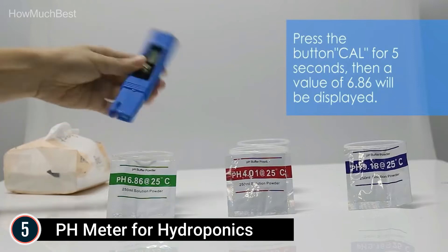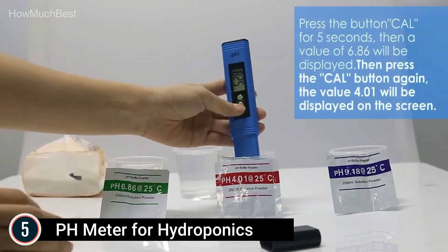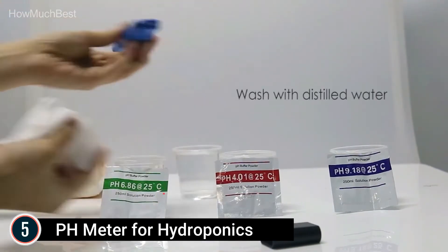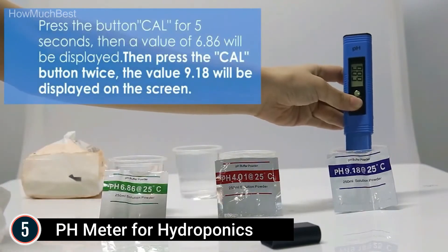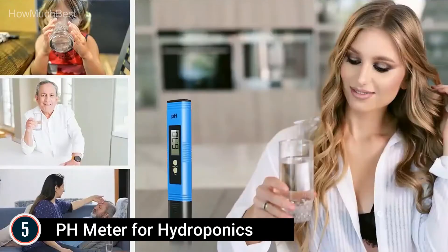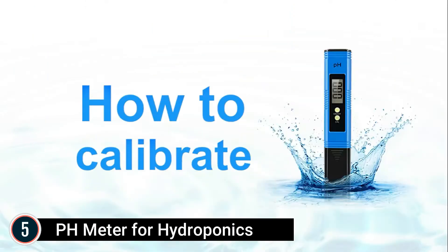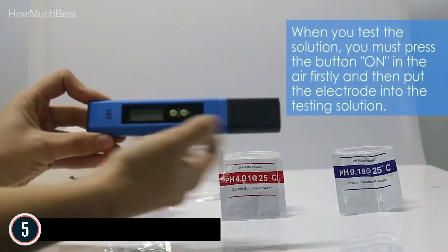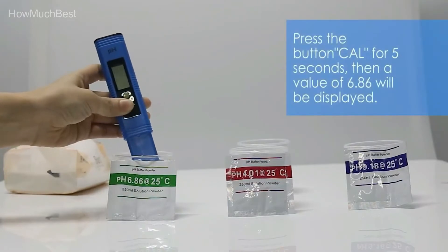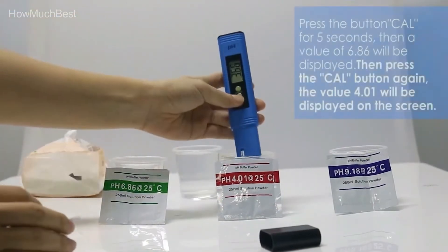Accurate — this digital pH pen has a precision of 0.01 and a testing range of 0 to 14 pH. A calibrated pH tester will be much more precise. Multi-application — this pH meter is suitable for testing the pH balance of drinking water, pool, fish tanks, food, warm springs, or hydroponics. It features automatic temperature compensation, so there is no need to worry about the temperature of the testing liquid, as the meter's auto-temperature feature adjusts to water temperatures and quality. The pH meter for water may help detect drinking water quality at any time so that we may drink healthy water with ease.